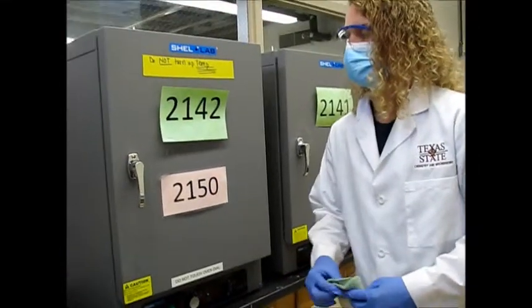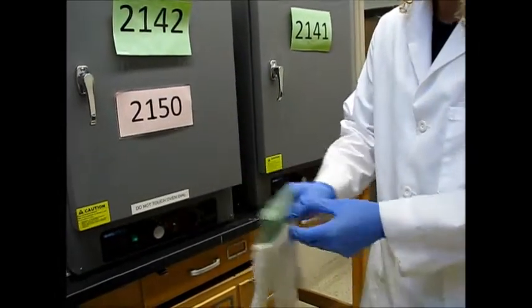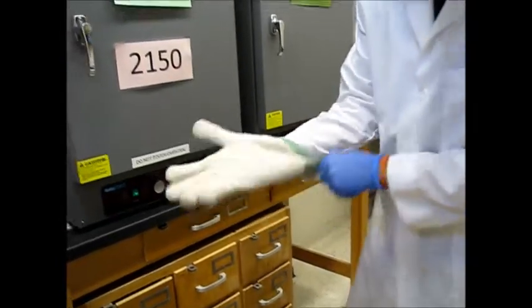So it's been about 10 or 15 minutes in the oven now. We need to make sure we grab our oven mitt. This is part of our PPE to ensure that we don't burn ourselves on the hot glass. So we're going to go ahead and put this on.